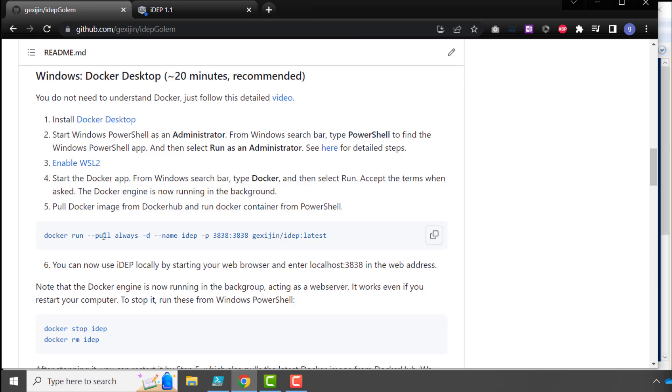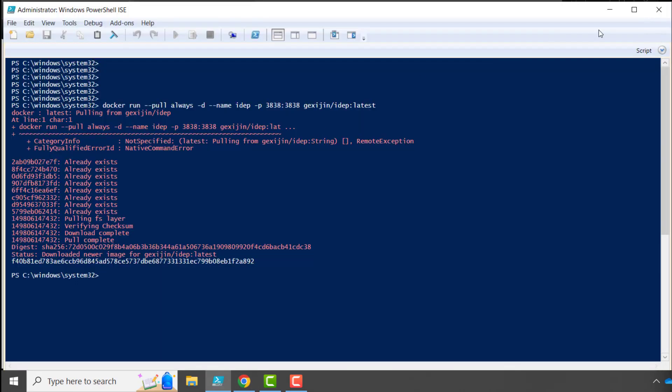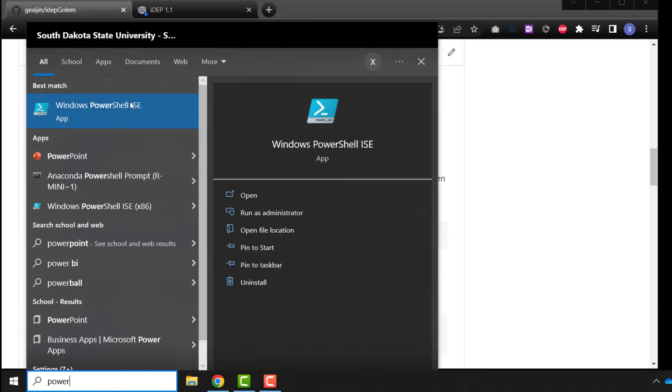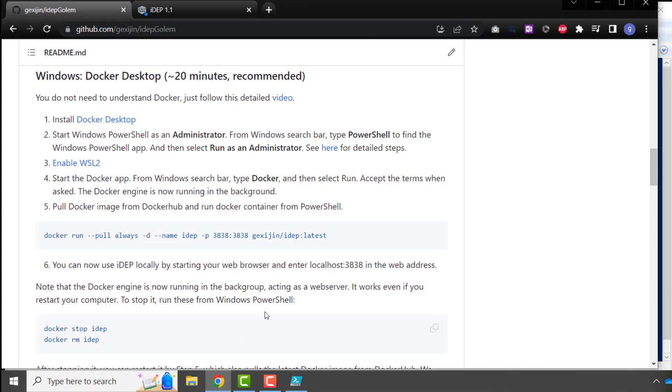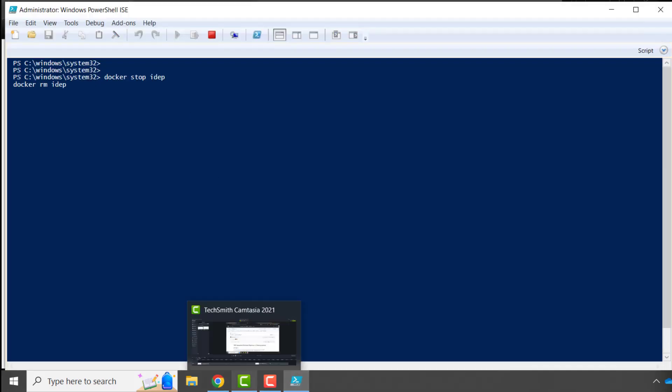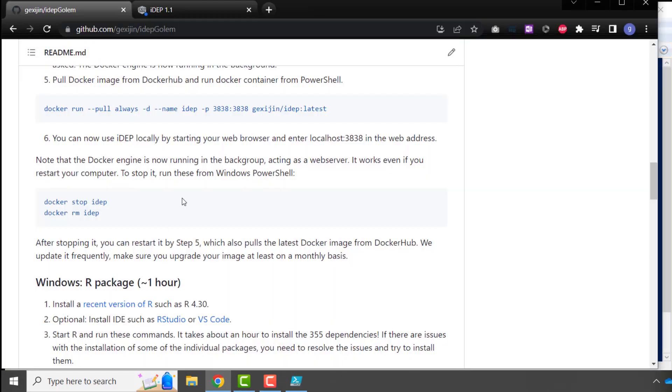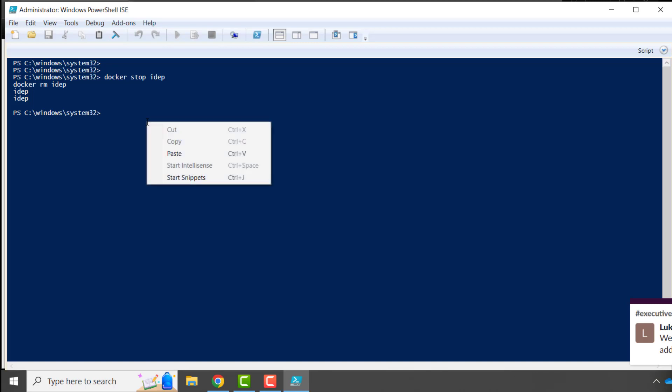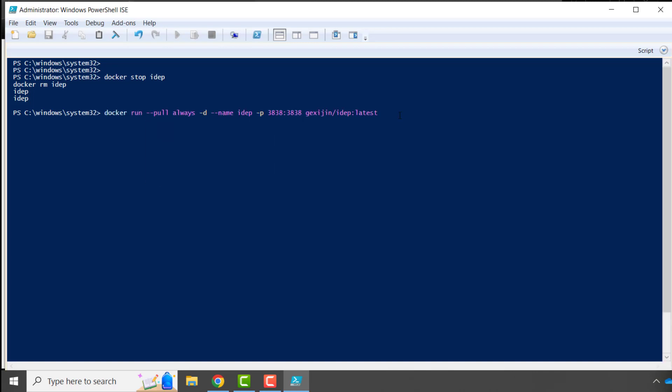Docker container will be running in the background. Even if you close the PowerShell Windows, the Docker engine is still running in the background. To stop this, you have to come back to the PowerShell, and run these two lines of code. So stop and delete the container first. After this, the Docker is stopped. To restart, you can always come here. This is also what you need to do if you have been running this for a while, and you want to pull the most recent Docker image from Docker Hub.